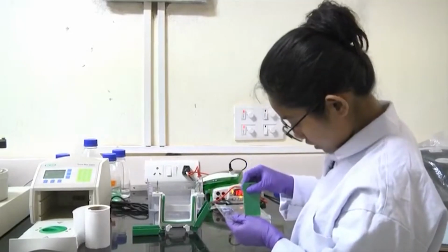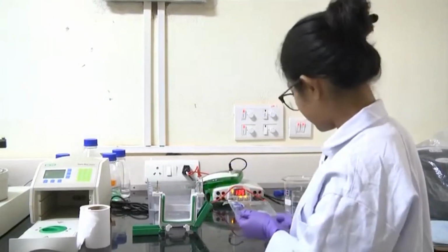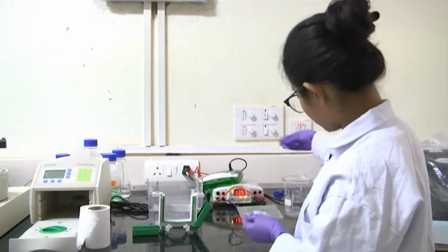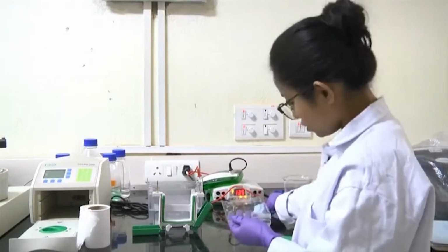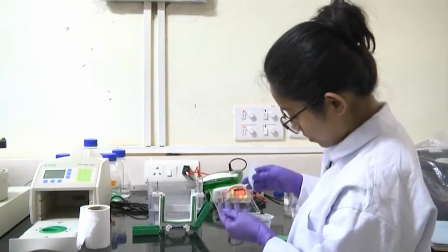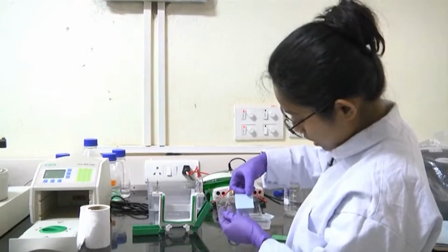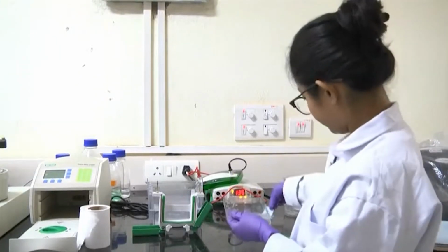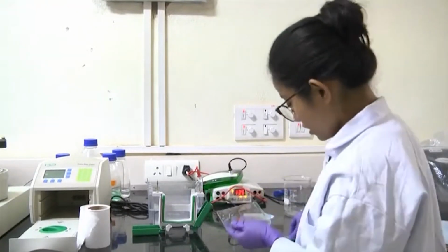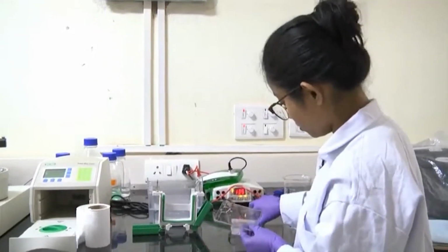Lower portion also I will cut. I can also check the size. So these are the things which we got from the membrane. My membrane is almost this size, so the gel should be a little bit smaller than the membrane. Now that I have separated out my gel, I have cut it into a smaller fragment.